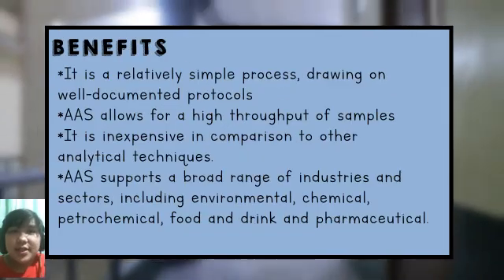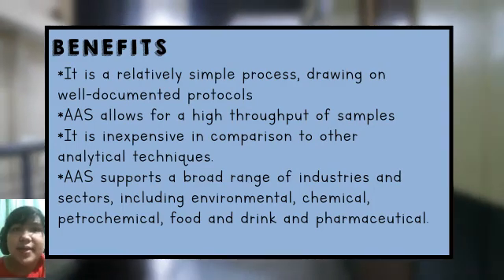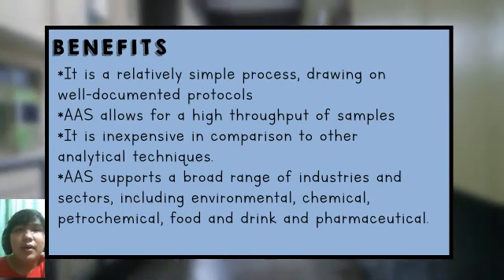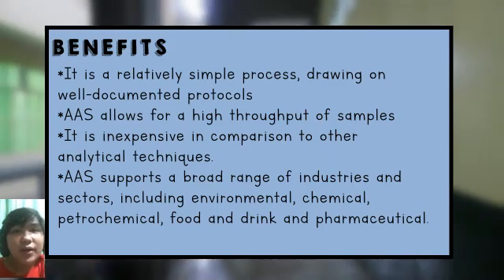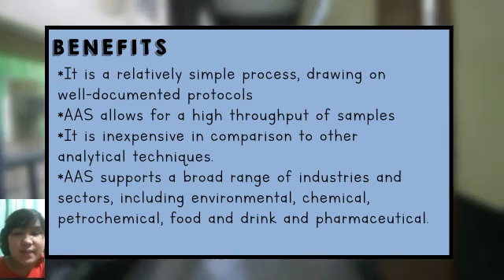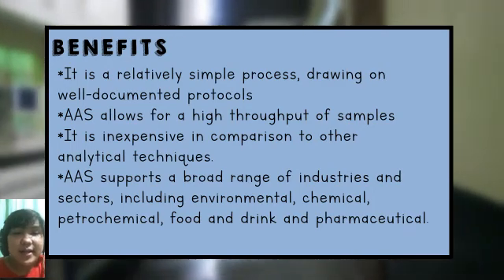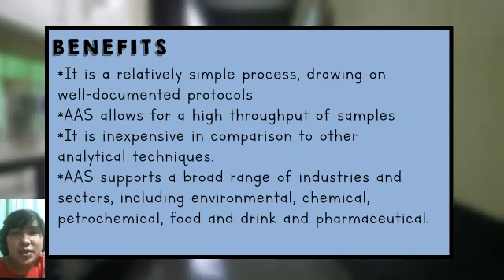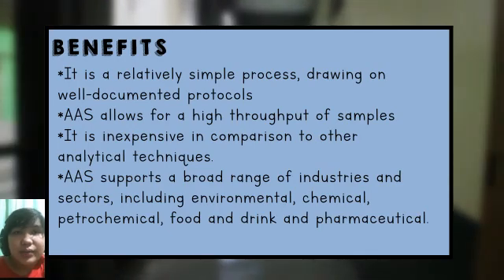These are the benefits of this technique. It is a relatively simple process drawing on well-documented protocols. It allows for high throughput of samples. It is inexpensive in comparison to other analytical techniques. It supports a broad range of industries and sectors including environmental, chemical, petrochemical, food and drink, and pharmaceutical.